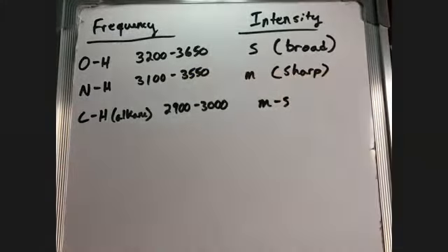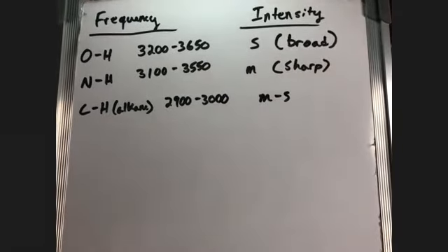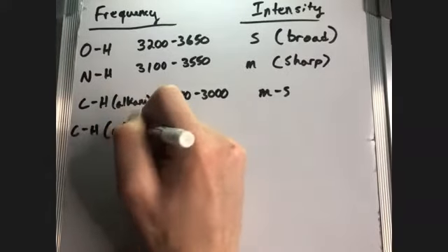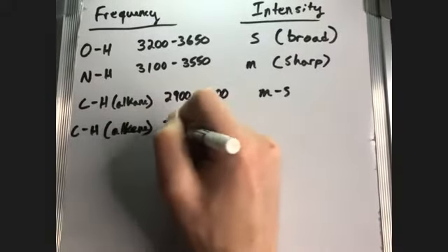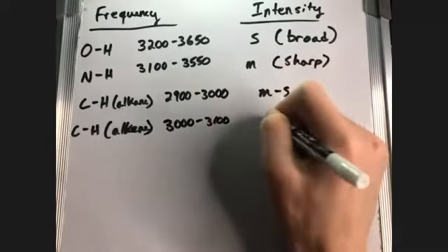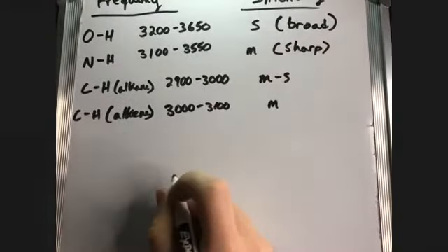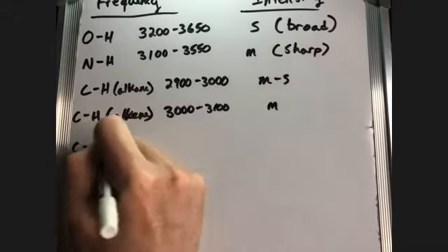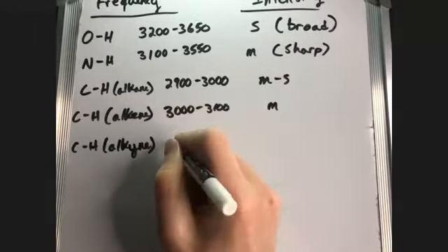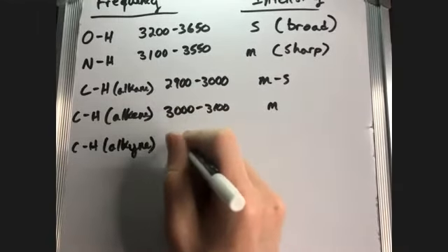They're just, it's kind of a mess in that region, like I was alluding to at the beginning. Then you can have the carbon-hydrogen of an alkene. This occurs above 3000. This is why I said the above 3000 is a region that you should definitely keep an eye out for, because that gives you more information than the fingerprint in other regions. The alkyne occurs between these regions.